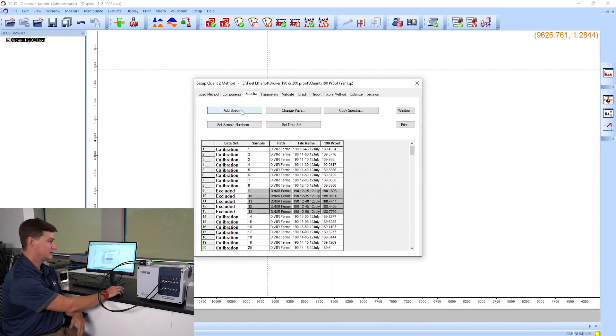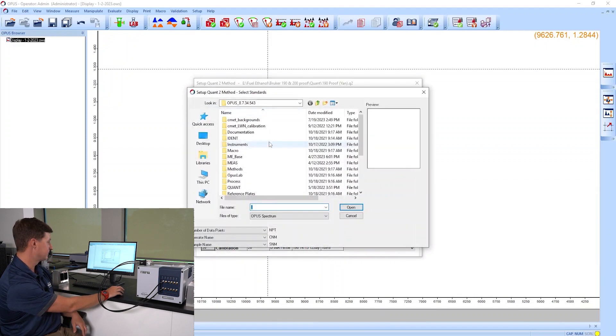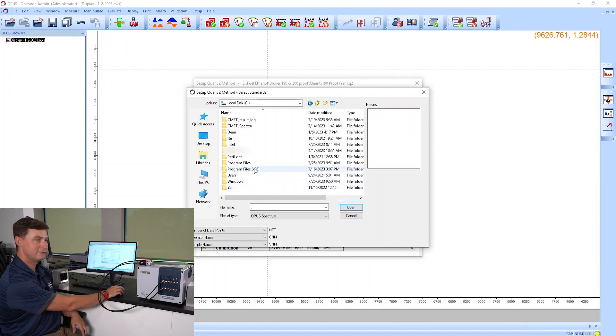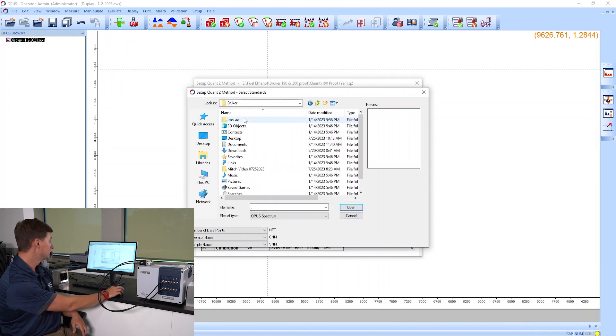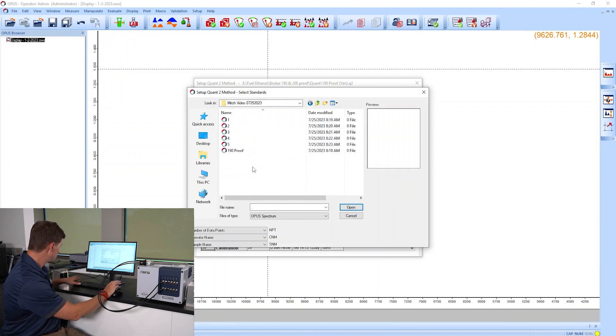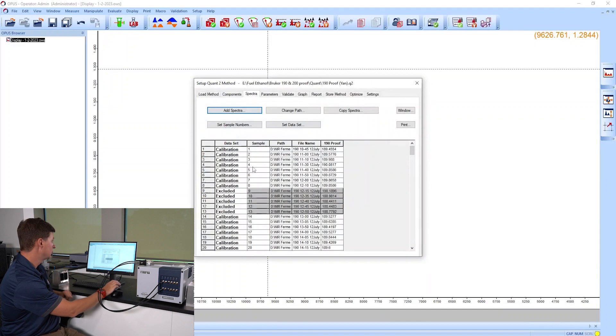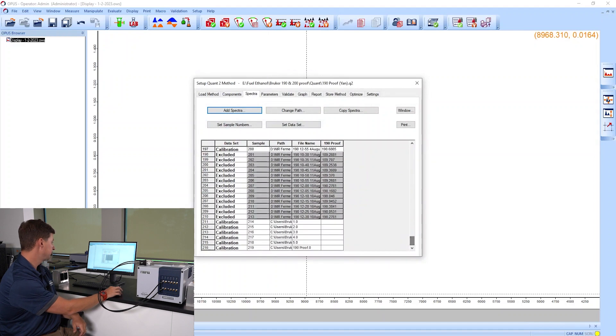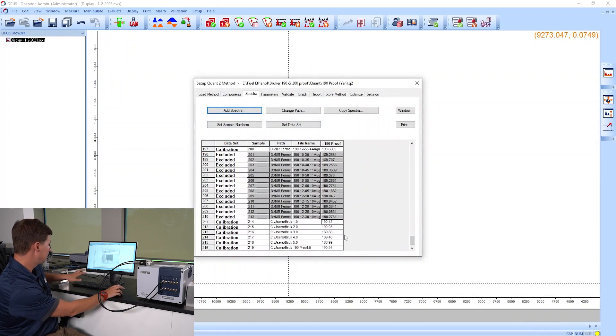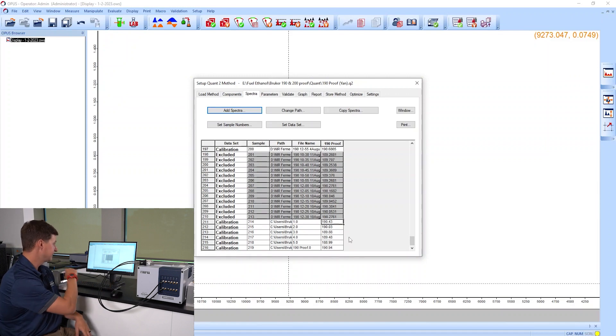I'm going to add the spectra from the six samples that I prepared earlier today. So I'm just going to go and find where I have those stored. There's my spectra. I have all the reference data, I'm going to paste that in there.